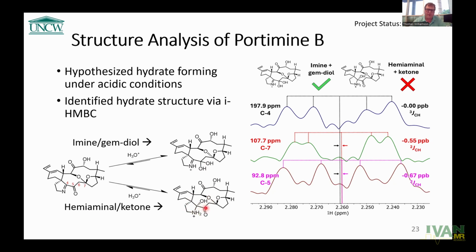And in order to differentiate which one of these was which, we needed to be able to determine which one of these chemical shifts was which. And so basically, is this far downfield ketone the 2-bond correlation, and then the next proton further upfield, or exactly what's going on.